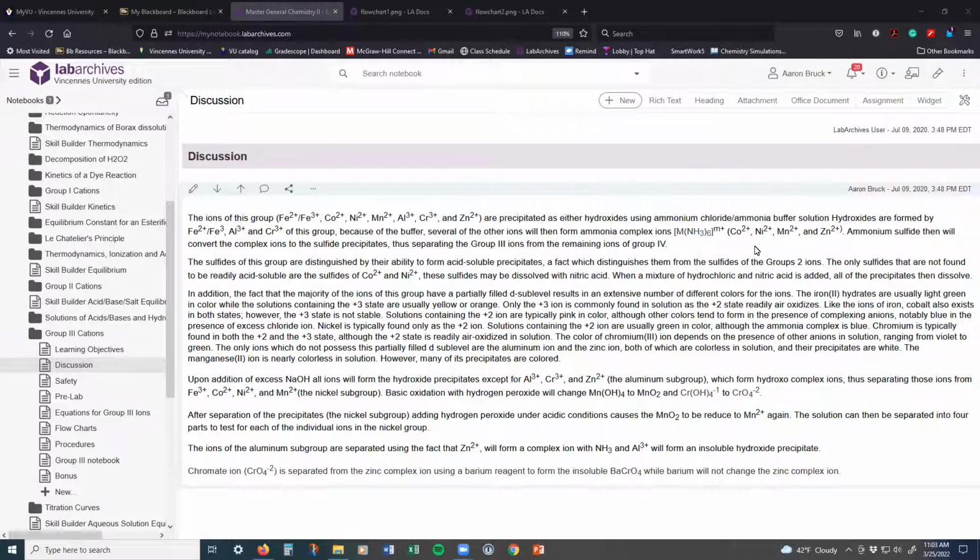The purpose of this video is to give an overview of the qualitative analysis of the group 3 cations. The majority of the substances in this group are transition metals. And so we're going to walk through what this group holds, what some of the procedures are, and then finally how to interpret the results and look at the pre-lab assignment for this experiment.